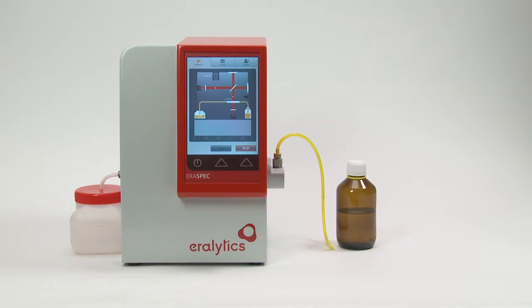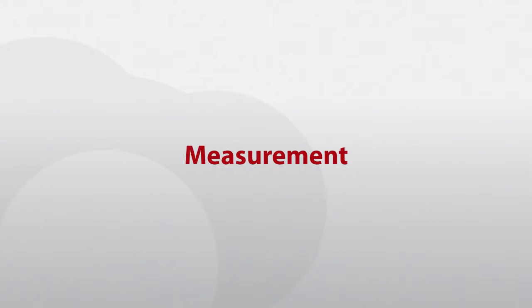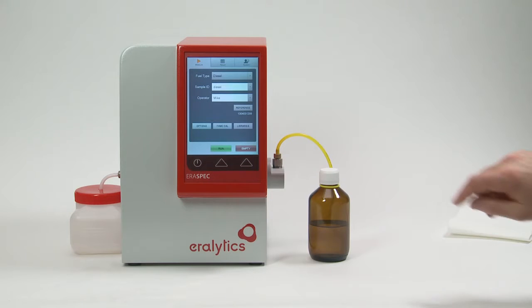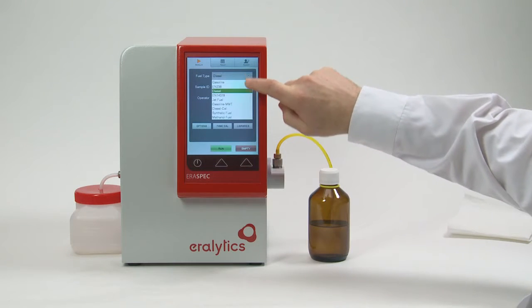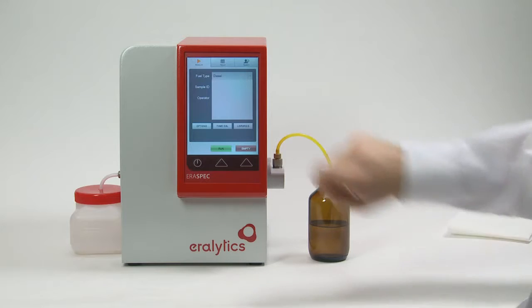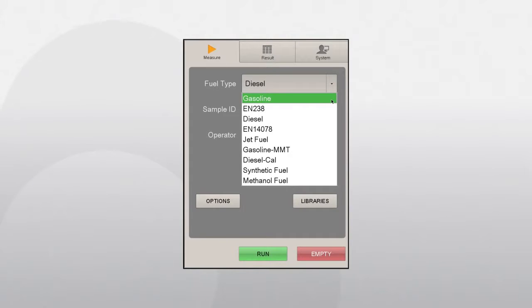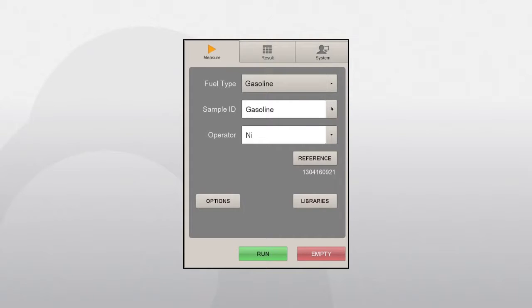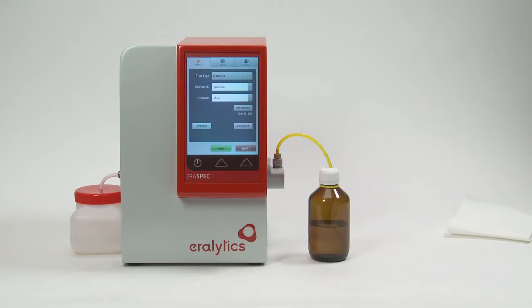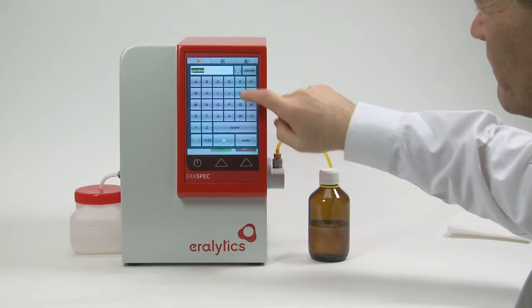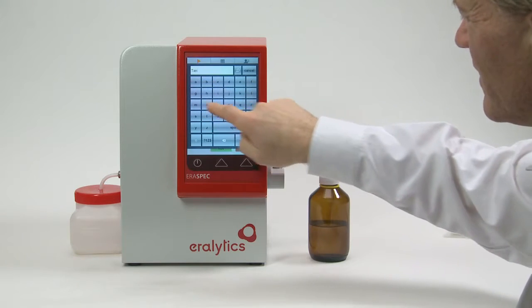Measurement: The first line of the measure menu displays the type of fuel to be analyzed or the method used for the measurement. If you want to analyze a different type of fuel or use a different method, select the desired measurement method from the drop-down list. After each change of the measurement type, the Aerospec will usually measure a new reference. Always wait until this measurement is finished.